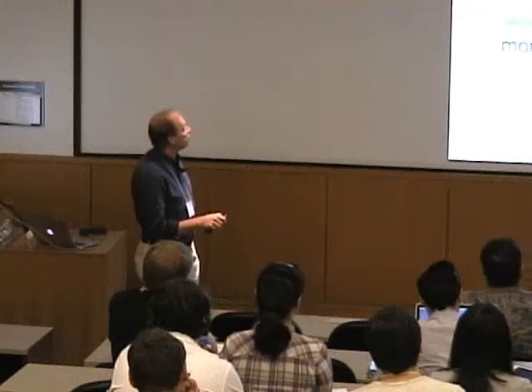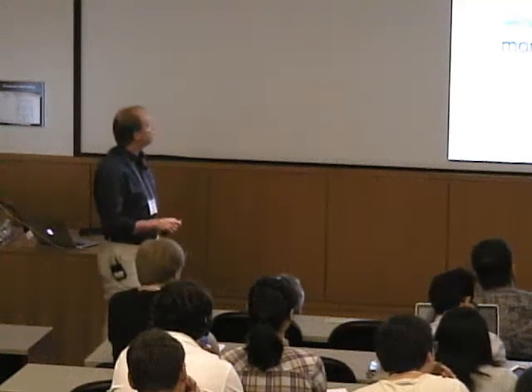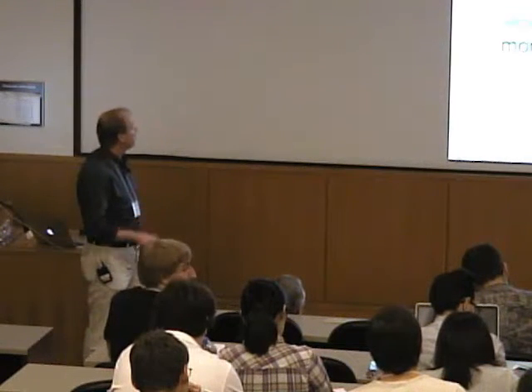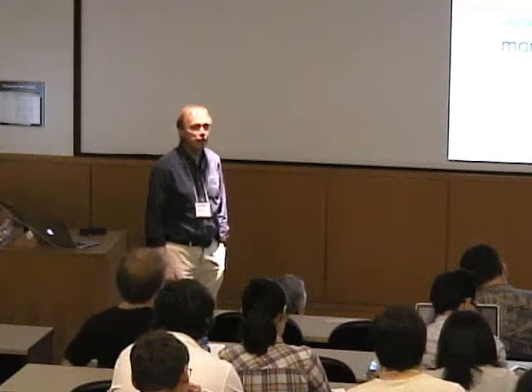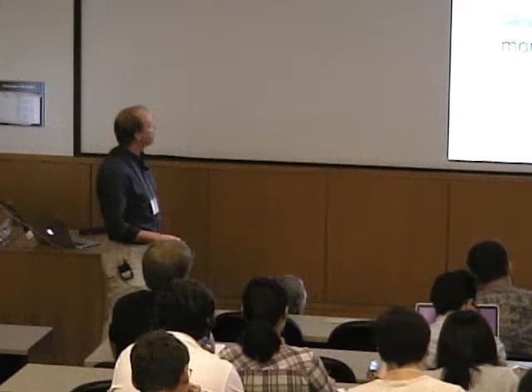Okay, so EPR spectroscopy, of course, is magnetic resonance on unpaired electrons. So we can only study substances that have unpaired electrons. If we look at the types of species that we can study with the method, free radicals are an obvious species where we have single unpaired electrons. But of course, transition metals, which have odd numbers of electrons, or if they're in a high spin configuration, will be paramagnetic, and so we can study them with the method.